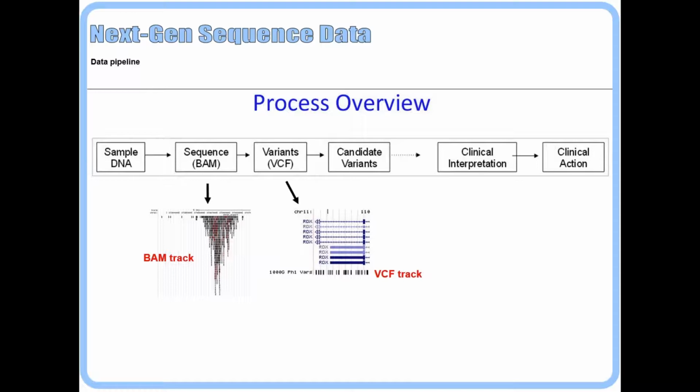In other experiments, you want to know how your sample differs from the reference. In that case, you call your variants and throw away the places where you have matched the reference, and then you condense that into a VCF file, variant call format. It's a way of getting all of the variants together in one spot. The graphic I show here is data from the 1,000 Genomes variation, and these data are available in the browser. A VCF file will actually hold data from one individual or hundreds of individuals or more in the file, and then the browser can display them for you.